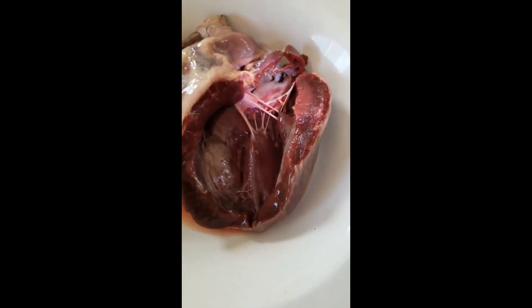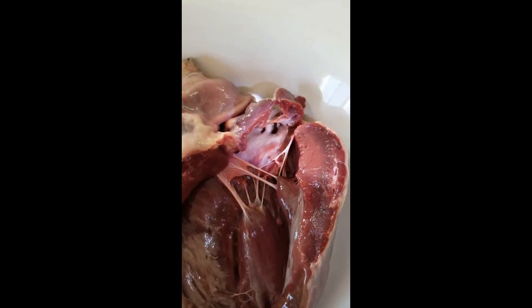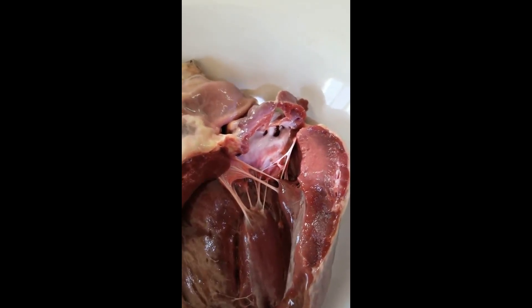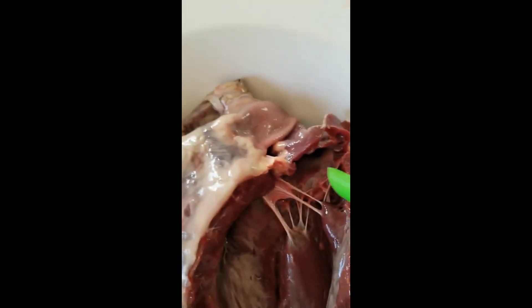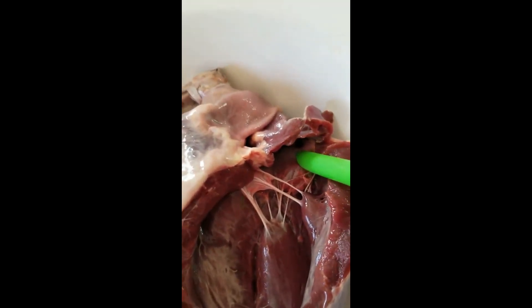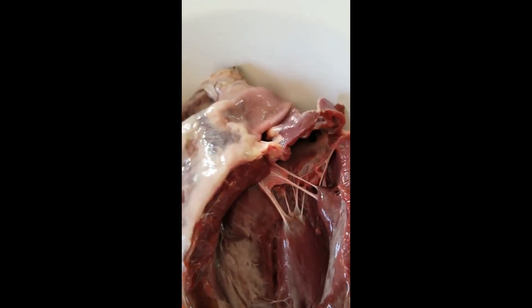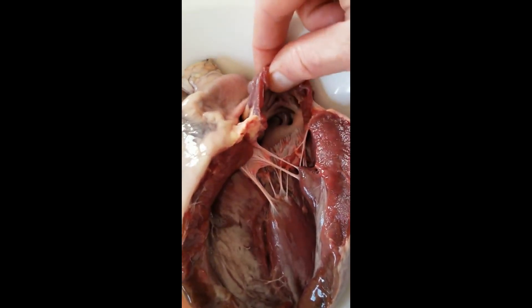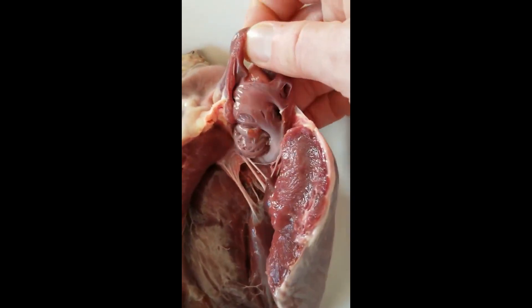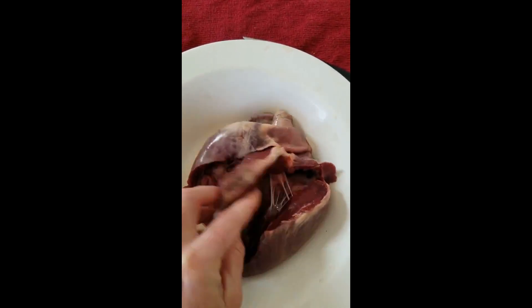Here is a shot of the inside of the left atrium. If we zoom in, there are two holes that look kind of like a pig snout back in there. Those two holes are two of the entrance points of the pulmonary veins. The pulmonary veins bring oxygenated blood back to the heart from the lungs.